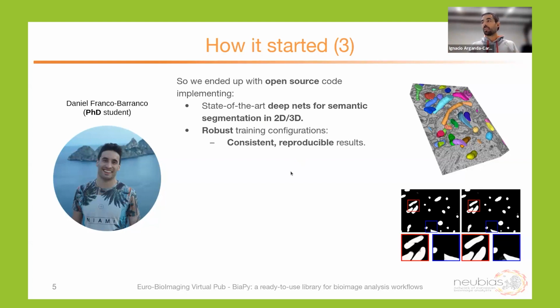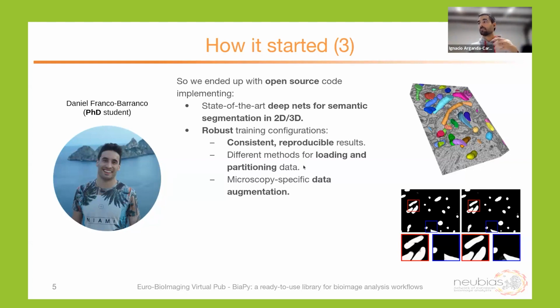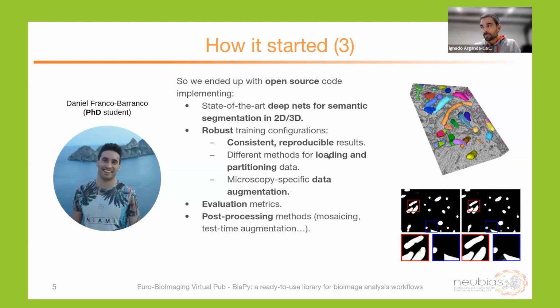So it was all very reproducible. And we have a bunch of methods to, of course, load the data, partition the data. We have data augmentation methods that were specific for the microscopy modalities that we were using. And of course, a bunch of evaluation metrics to quantify and properly compare the different results.